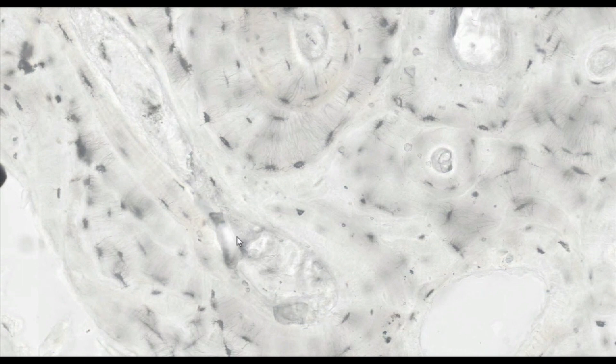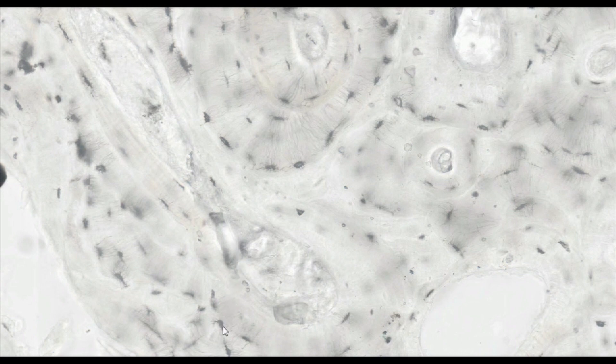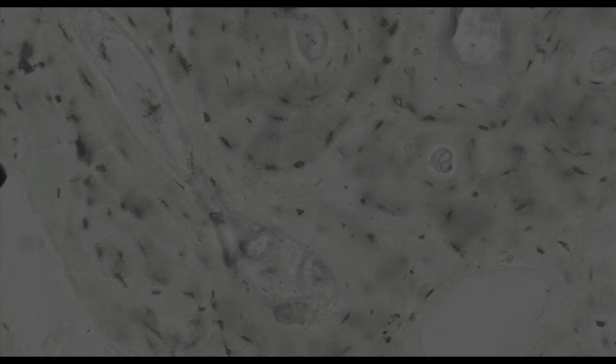Under the periosteum, which is not shown in the specimen, several external basic lamellae can be identified. From the side of the bone marrow canal, the bone is surrounded by internal basic lamellae.